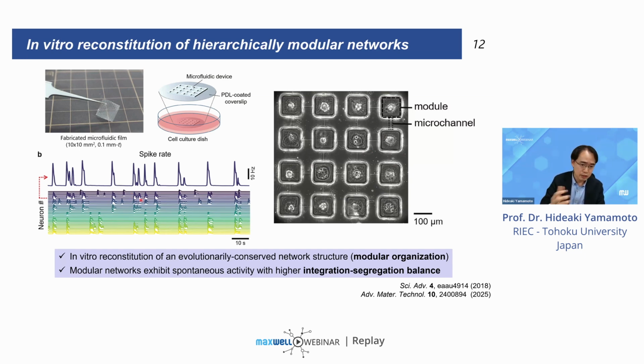Such a balance of synchrony and asynchrony, or integration and segregation, is firstly an important portrait of neural activity in animal brains, but also plays an important role when using these systems in reservoir computing tasks that I'll come back to later.